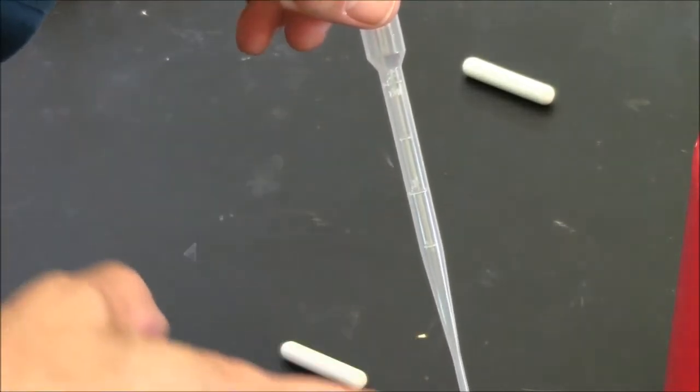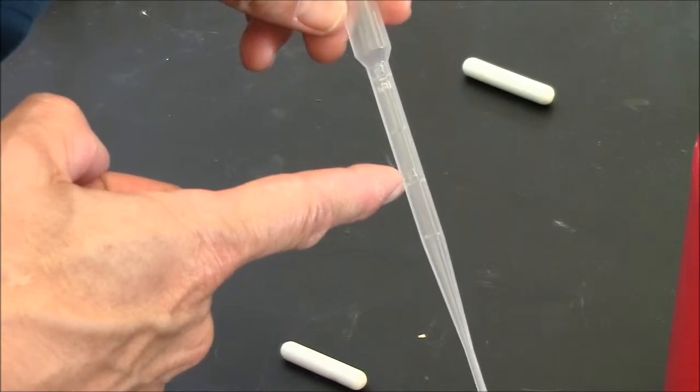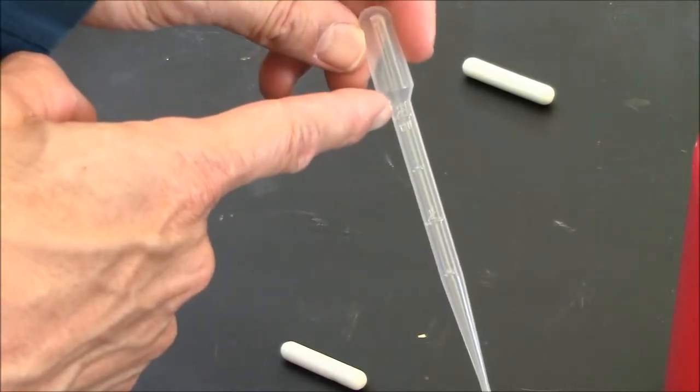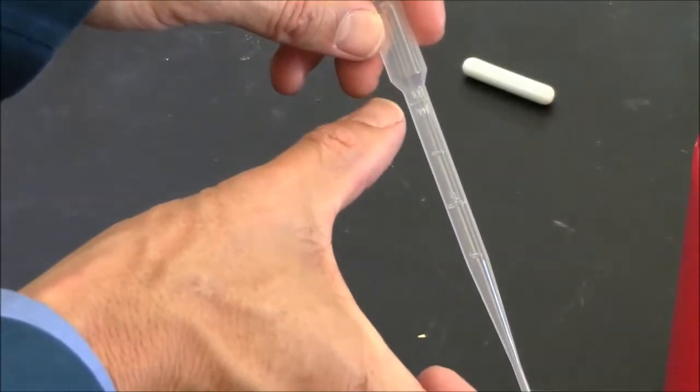You'll be using these pipettes to measure one milliliter today. There's a line here that says one, and a line here that says two. This is one milliliter from here to here. This is two milliliters from here to here.